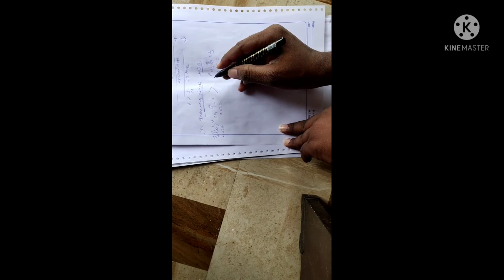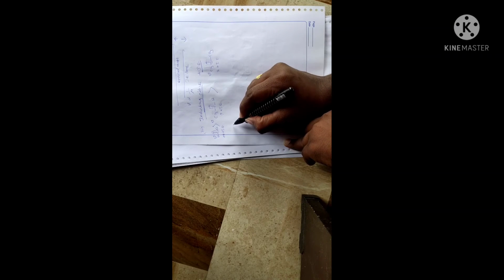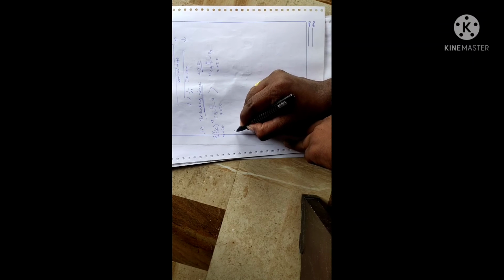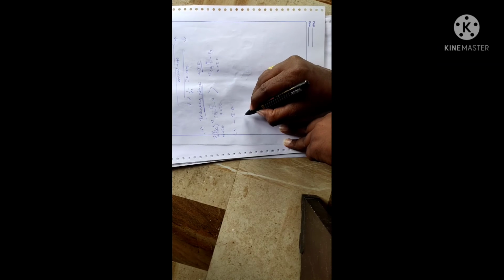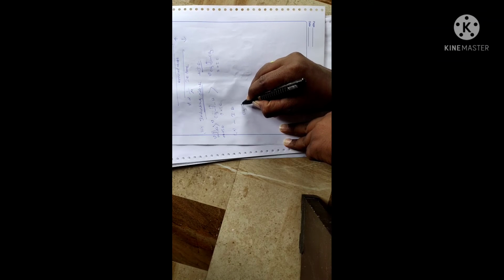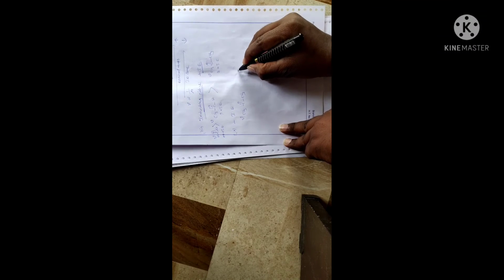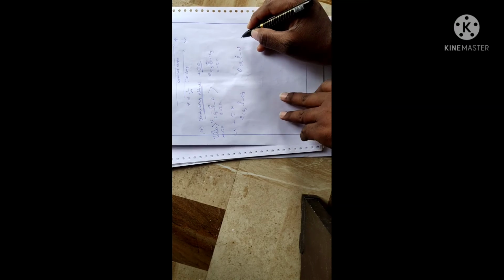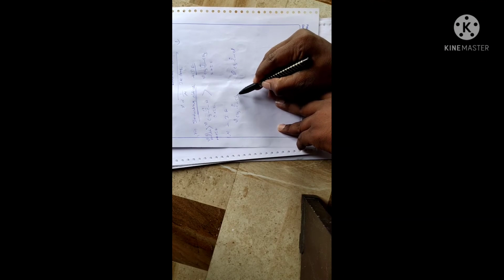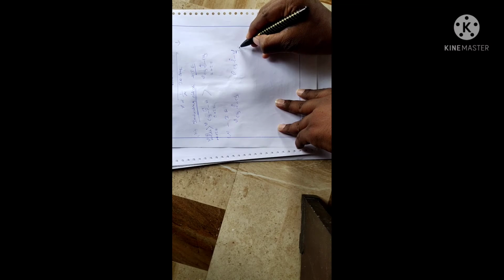This is the inductive effect. Now the fourth one: minus I effect groups, minus inductive effect groups, which are withdrawing groups. For example, take CH3COCH3 and compare its frequency with CH3COCl. Here we substitute one of the methyl groups with chlorine, a minus inductive effect group.